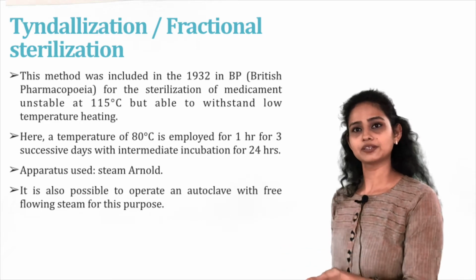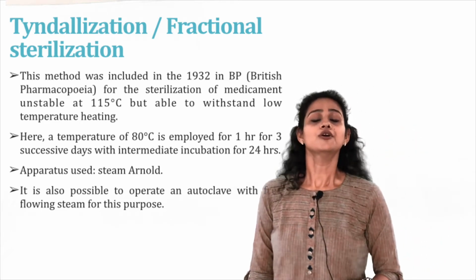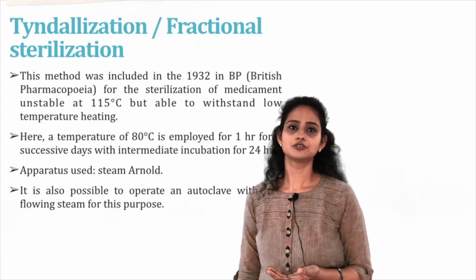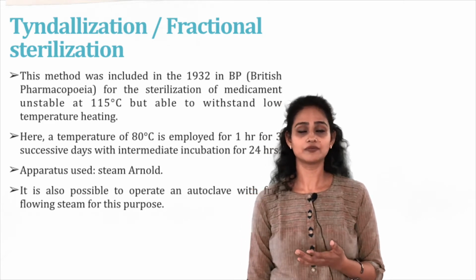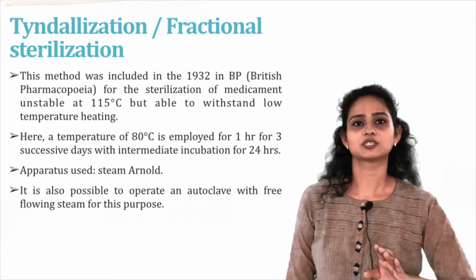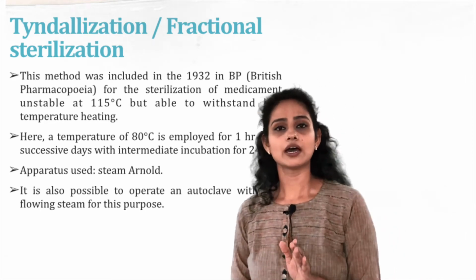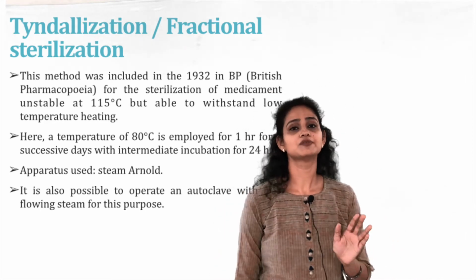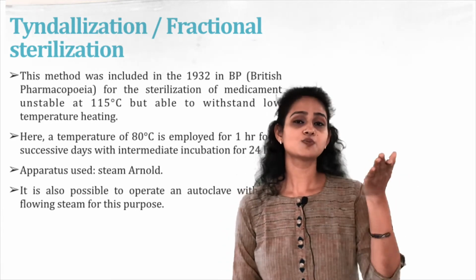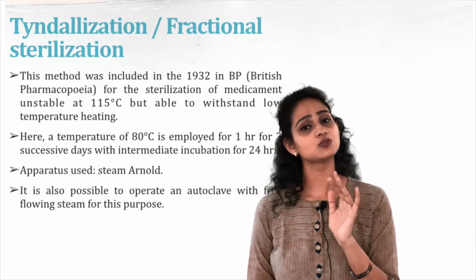Then you have to incubate them, and for the 3rd day, that is the last day, again you have to perform sterilization. Why are we doing so? To kill spores, okay. Spores are very difficult microorganisms to kill, right. So, what we will be doing, we will be first exposing them to harsh conditions. So, microorganisms will be converted into spores, right. After giving harsh conditions, we will be providing them temperature or conditions to grow. So, all spores will be converted to vegetative cells, right. Once they are converted into vegetative cells, we will be killing them.